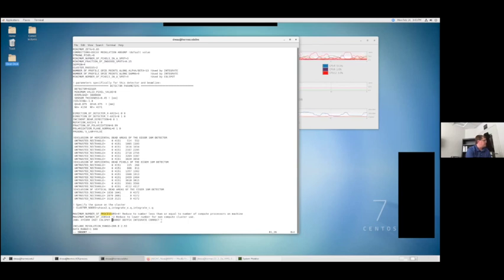And again, I'll show you that again when we get to the GUI. Include resolution range just tells it what resolution you're looking at, so a low resolution limit and a high resolution limit. If you're trying to reprocess something from Rapid, you might want to give a smaller value for the high resolution limit. And then the data range is the number of images in the data set.